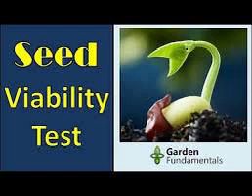First count. It is done along with the regular germination test. In this, the number of normal seedlings germinated on the first count day, as specified in the germination test for each species, is counted. The higher the number of normal seedlings, the greater the seed vigor. Seedling growth rate and dry weight.